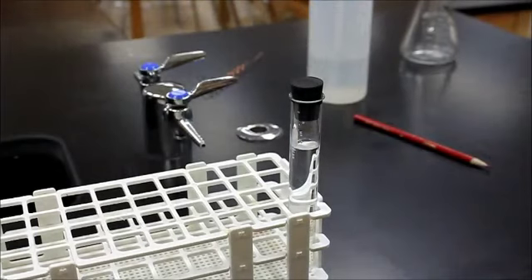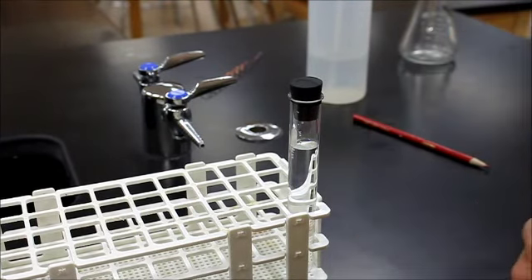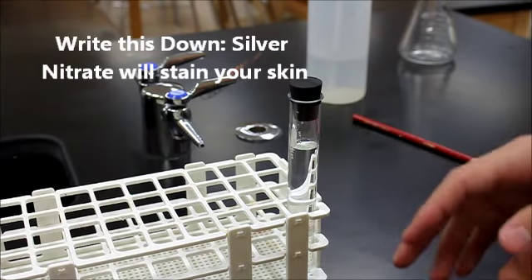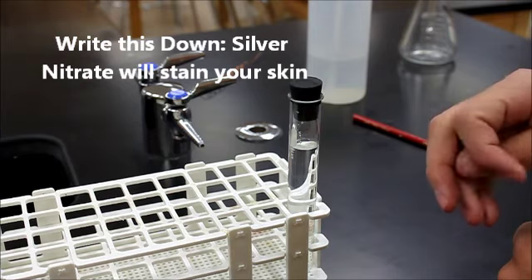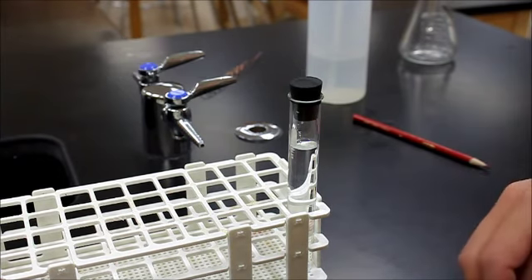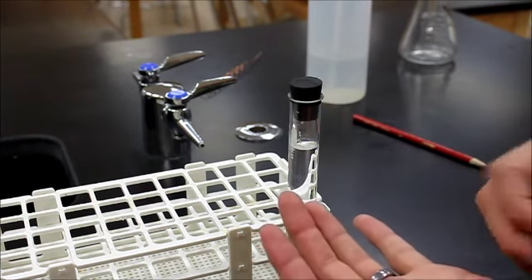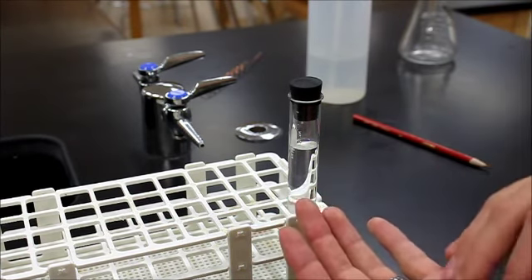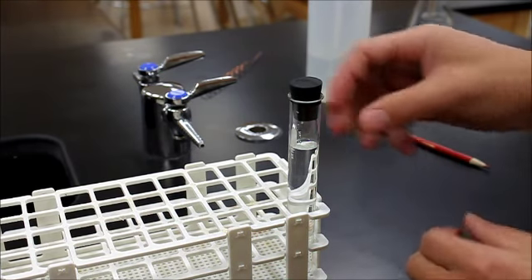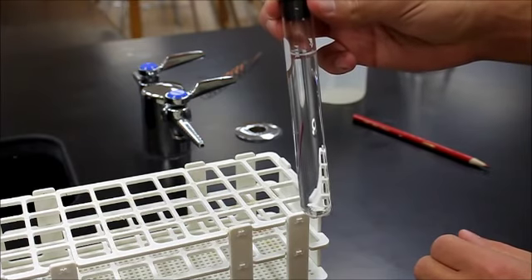One of the biggest safety concerns we're going to have is going to be silver nitrate. The silver nitrate, although it's not poisonous, will darken or stain your skin kind of a brownish color if you get it on your skin. It is a permanent stain, however you have to keep in mind that your skin is constantly being shed, so it's not going to stay around for much more than about a week. But if you don't want big black stains on your hands for about a week, then you're going to want to be careful with this and try to not get it on your hands.